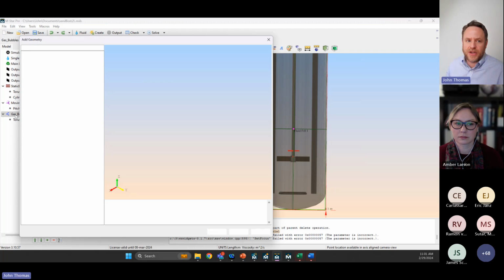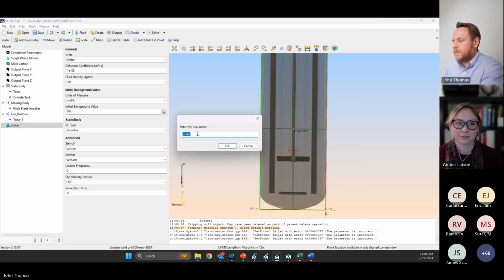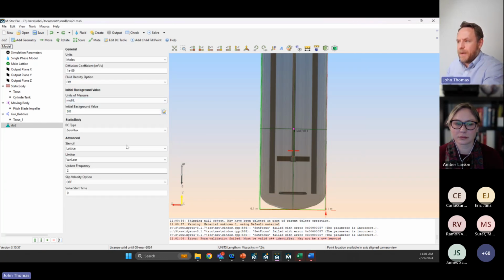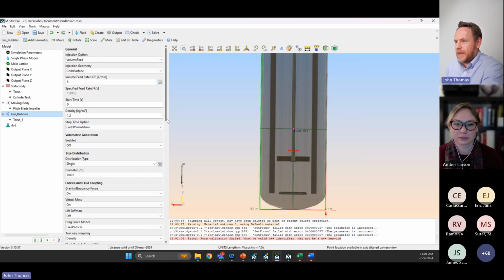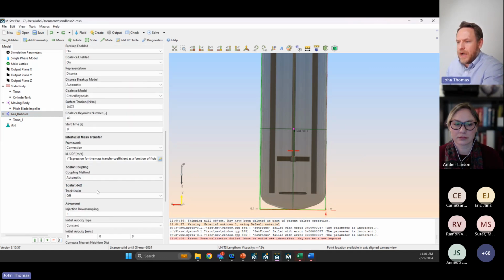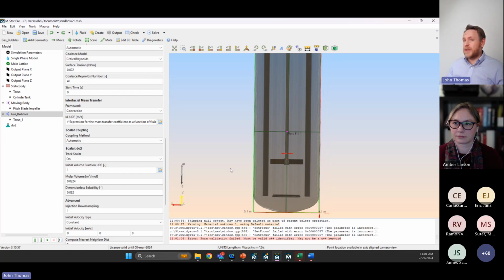I know we're at time, so people got to jump. There's no love lost. If I go over here to DO, let's say dissolved oxygen, I can go to my gas bubbles. This is all in the papers, all in the online documentation as well. I can go here to coupling. I'll couple to my scalar DO here and specify the volume fraction of oxygen, the molar volume and solubility. That's how we do the coupling. Coupling is very straightforward. Use the Lagrangian approach, and importantly, it's modeled at the level of the individual bubble basis.